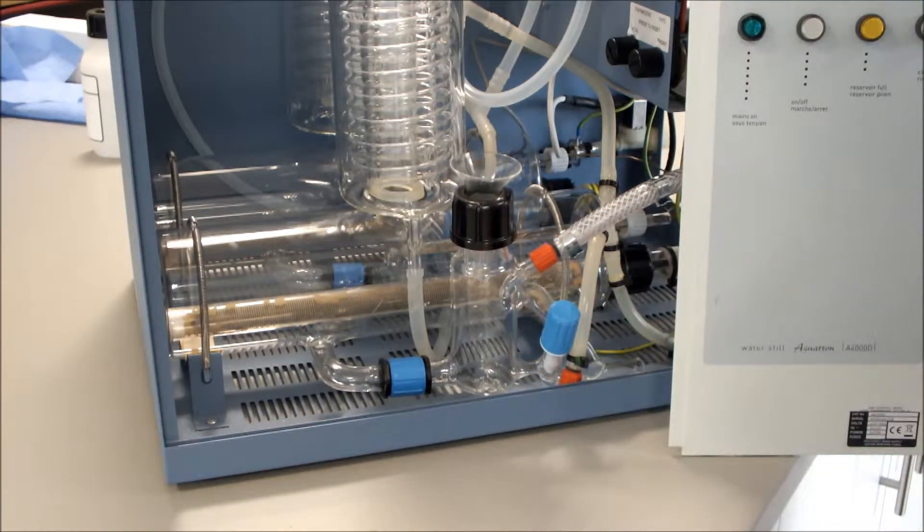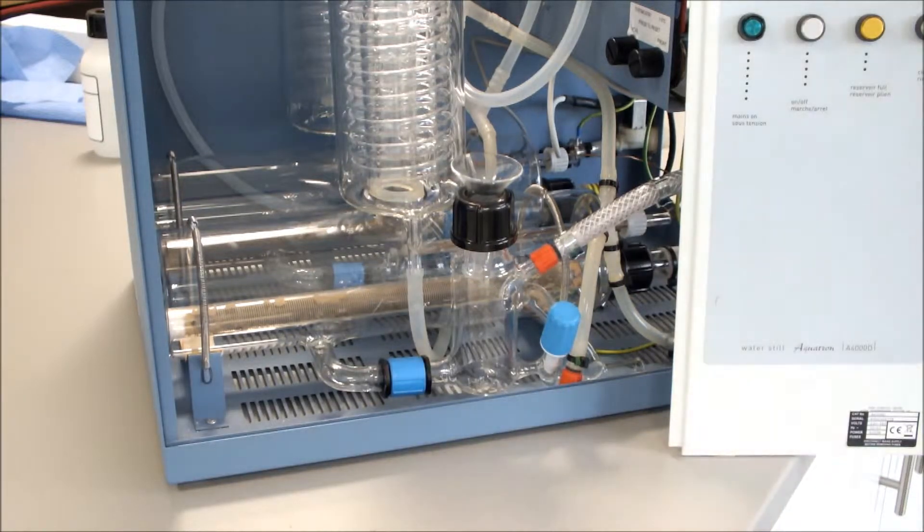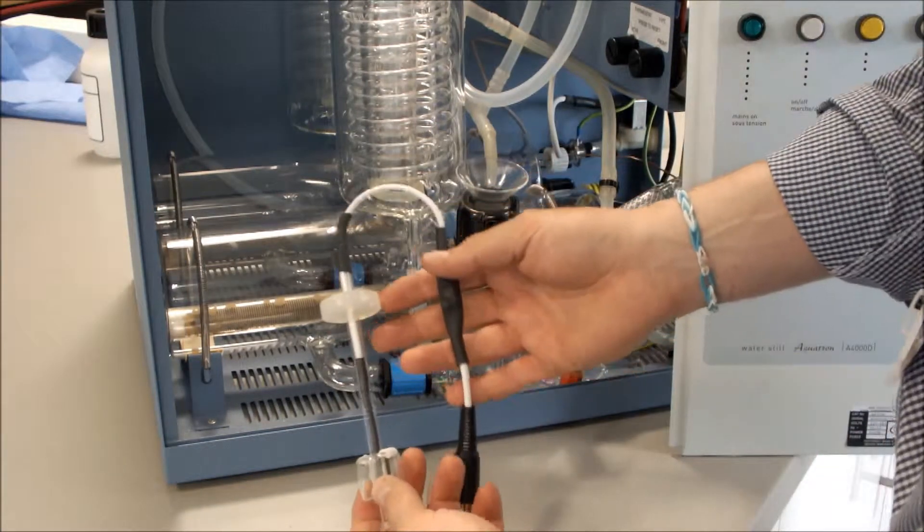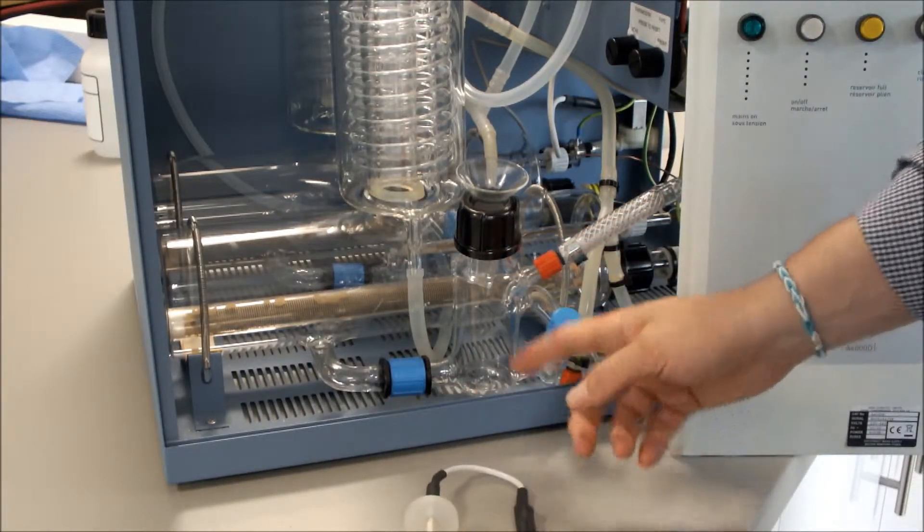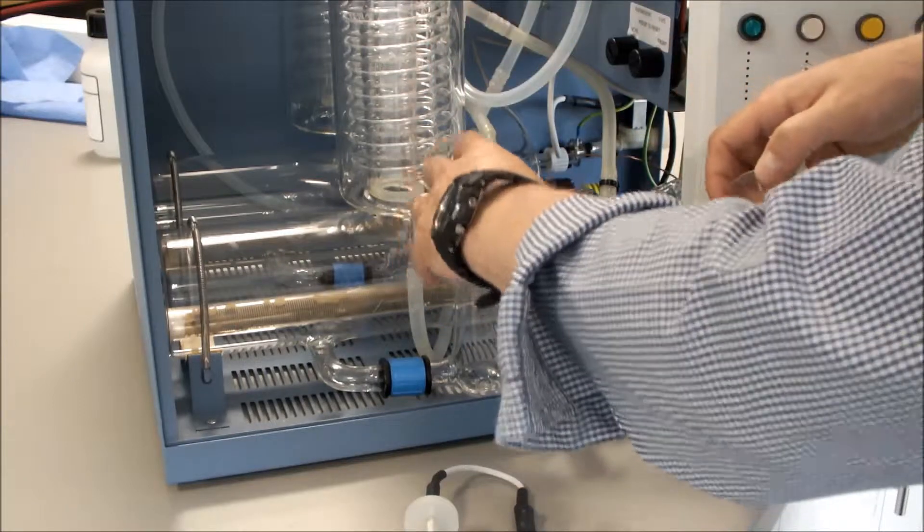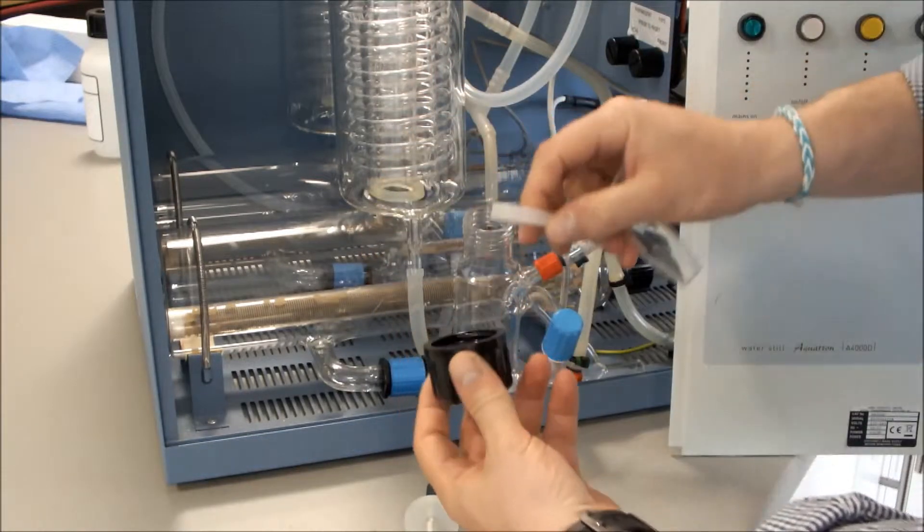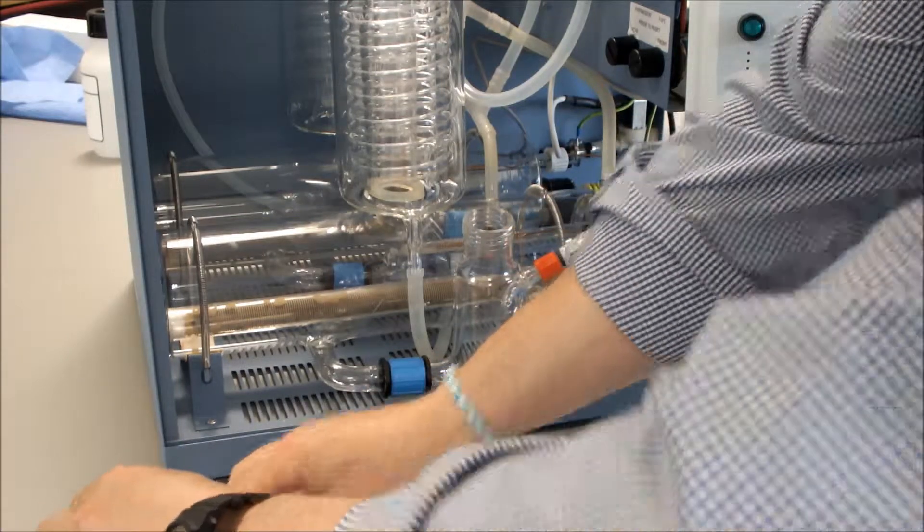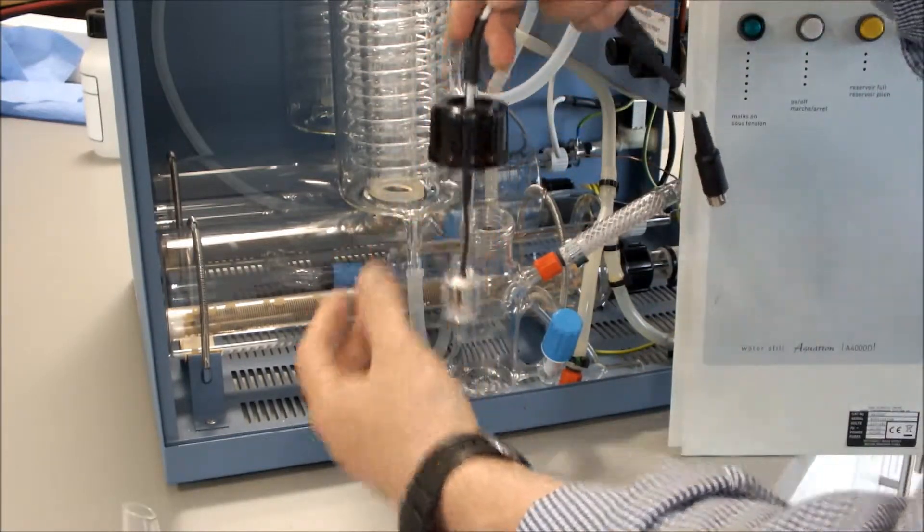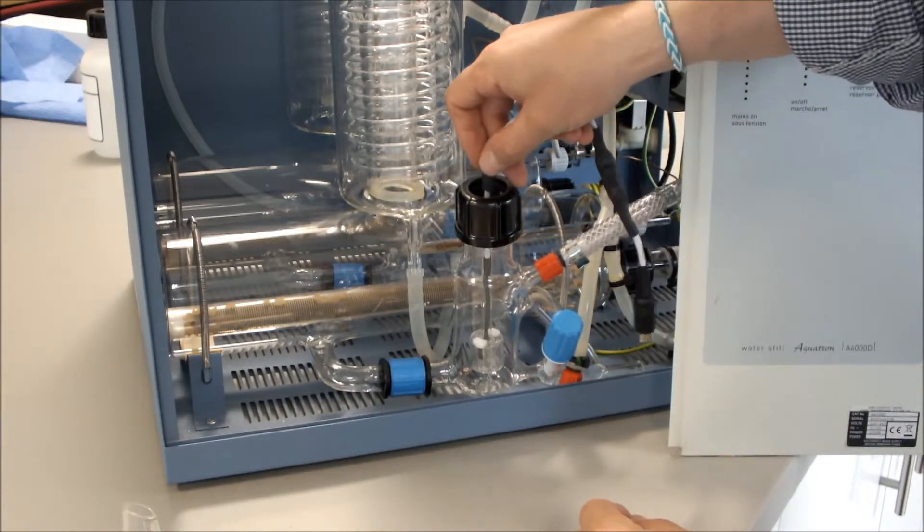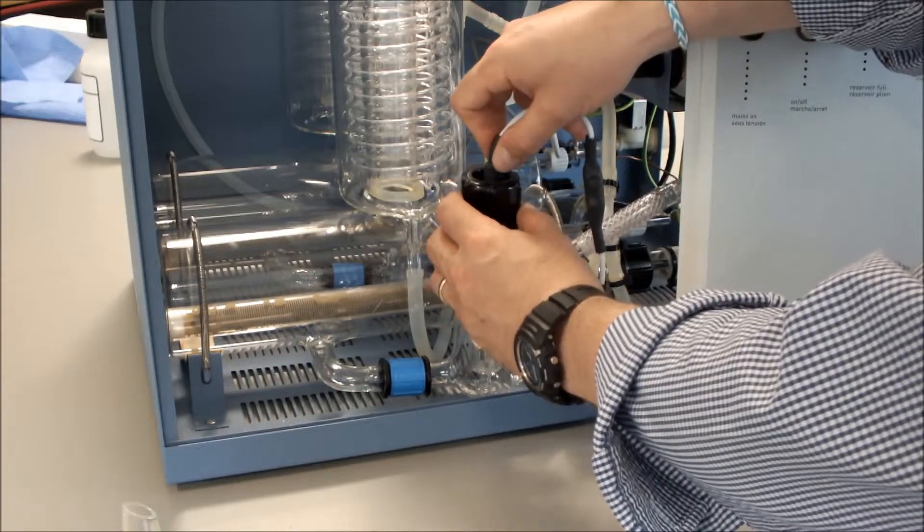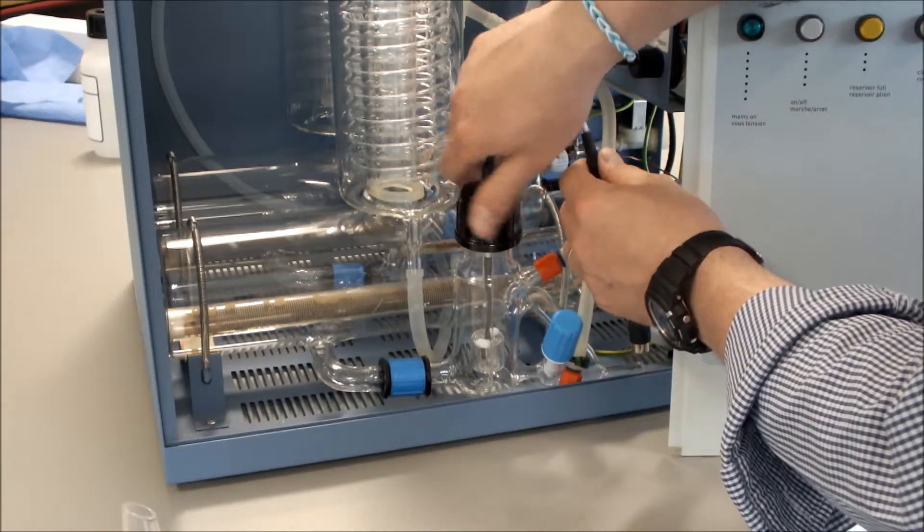We'll now fit our float level assembly to our boiler level control. First, we undo the black cap, remove the funnel, remove the black cap and the seal. We then fit the black cap onto our float assembly, which comes complete with seal. The float assembly fits like so. At the bottom of the boiler control, there's a cutout. That is where the bottom of the float assembly actually fits. We can then tighten up the black cap.